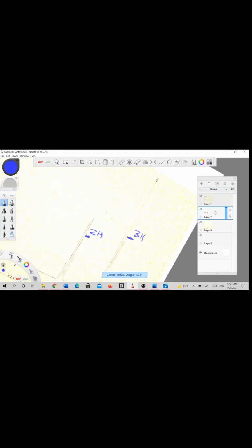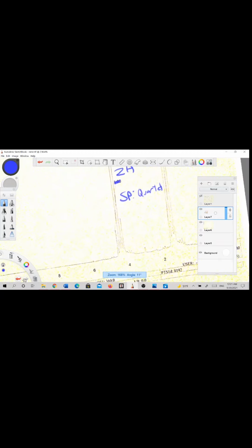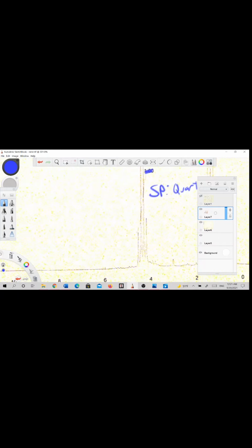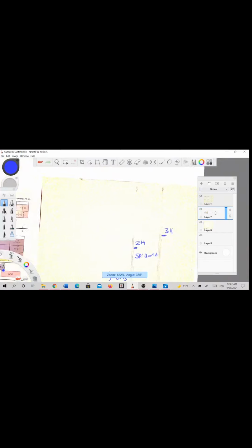So let's look at this first peak here. Right off the bat, it is a quartet. The splitting pattern, SP for short, is a quartet, so we know what its neighbor looks like. If I had to guess, its neighbor is probably just a CH3. But let's look at the chemical shift, which is 4.316.